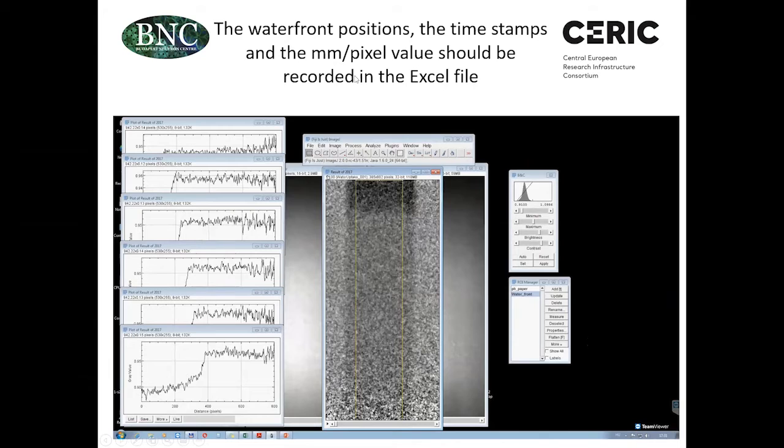We have an Excel sheet which we prepared for the evaluation, where basically one needs to enter only these midpoint coordinates, and the Excel file will plot the diagrams for you.